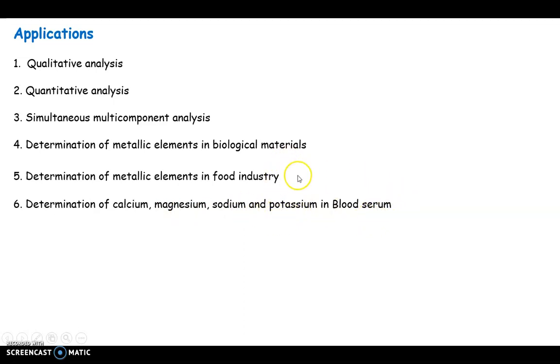So this is all about atomic absorption spectroscopy, its principle, instrumentation and different applications.